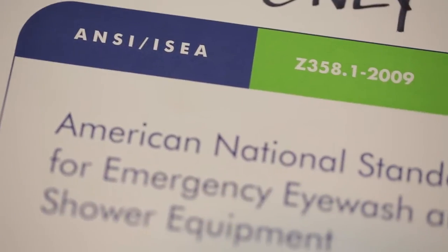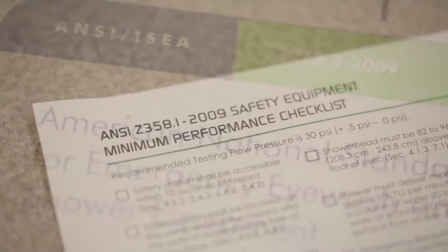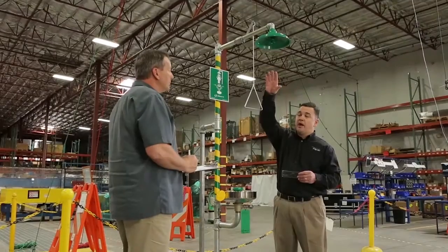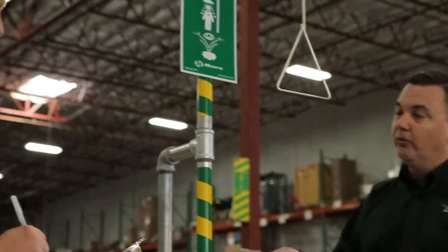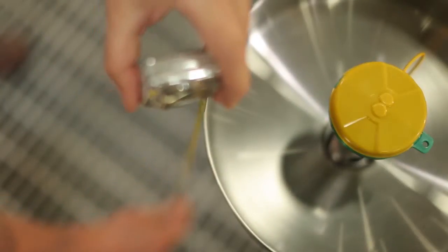The Axion Advantage gives safety decision makers the ability to advance their existing emergency equipment to the best in class, while not sacrificing existing ANSI compliance when properly installed. The Axion Advantage system contains the appropriate Axion replacement components to transform most competitive units to Axion MSR, as well as supplemental information that will aid the installer in assuring continued compliance to the ANSI standard.